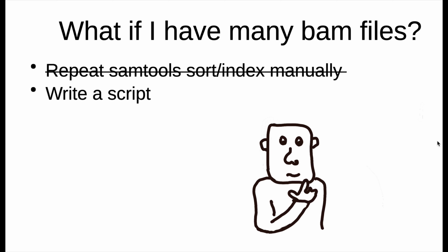You might think, okay, it works fine with a single file, but what if I have many BAM files? Really a lot? Would I repeat samtools sort and index manually? Don't do it. Then you have to write a script, and I will tell you how to do it next time.